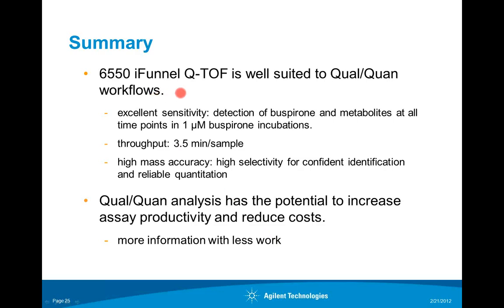So in summary, the 6550 Q-TOF is well suited to the Qual/Quan workflows. Excellent sensitivity is demonstrated with detection of buspirone and metabolites at all time points in the 1 micromolar buspirone incubations. This workflow also meets the throughput expectation with a runtime of about 3.5 minutes per sample.